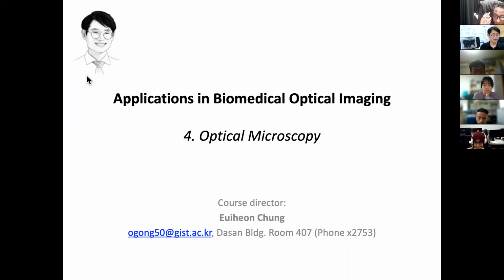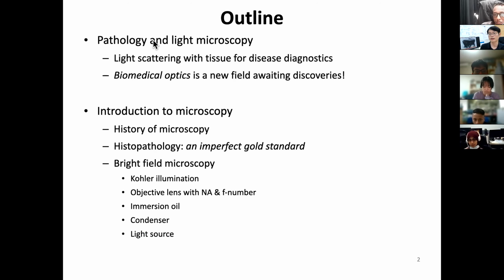Okay, so today's class is, I guess, one of the most important throughout the lecture. So we want to focus really. So let's discuss optical microscopy. And I will actually go through a little bit of the applications. So that's pathology and light microscopy.